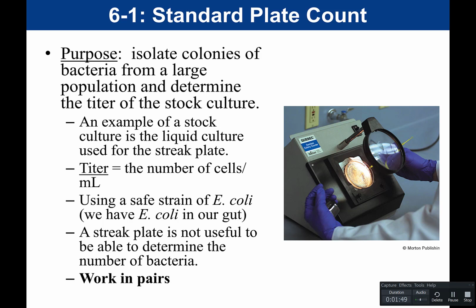There's no way to determine the concentration when looking at a streak plate, because quadrant number 1 is going to have a lawn. It's going to have so much bacteria that you can't count it. So a streak plate is not going to allow you to quantitate the number of bacteria. So instead, we would do a standard plate count. We're going to isolate individual colonies, and once we do that, we will be able to quantitate or determine the titer of the stock culture.